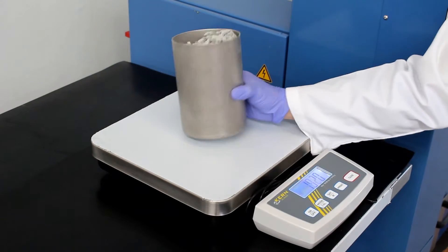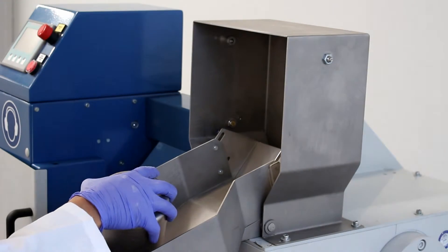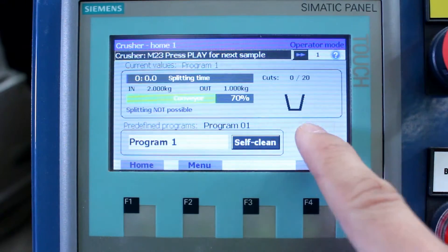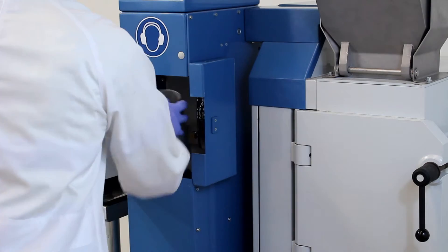Samples are pre-weighed on the balance and are then safely and ergonomically loaded into the crusher unit before the process is started. The sample is crushed and split to the desired ratio, and the processed aliquot is returned to the operator at a convenient height.